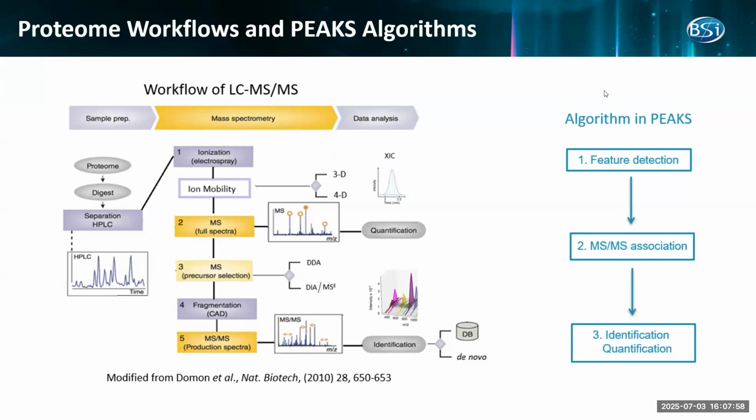More specifically, before we talk about the details of the algorithm functions, I would like to take some time to recall PEAKS' design logic. To my knowledge, the general proteomics workflow has sample processing, mass spectrometry, and data analysis. The PEAKS team believes data analysis is not just a tool to get the result; it is actually part of the whole workflow. From the workflow, we get a sample and run mass spec. Finally, the output is a raw data file.